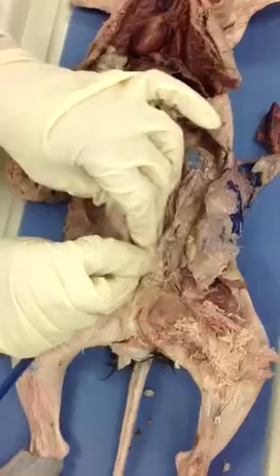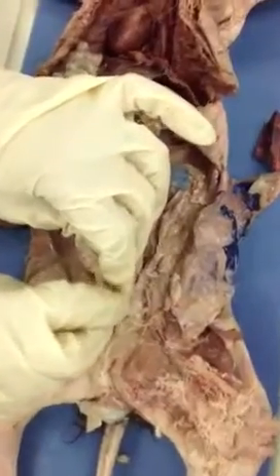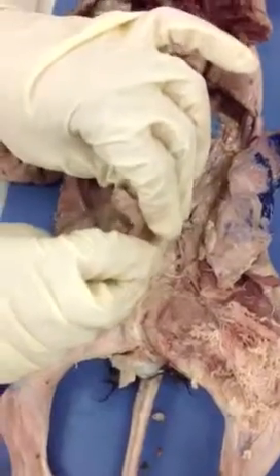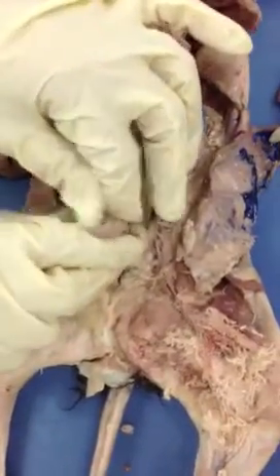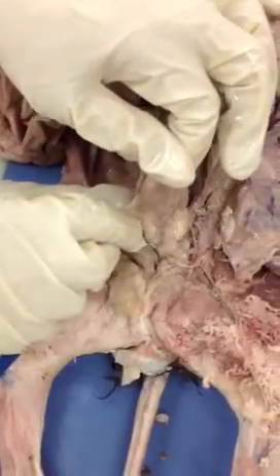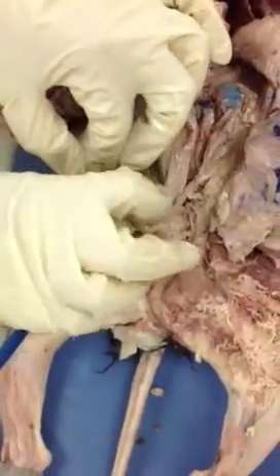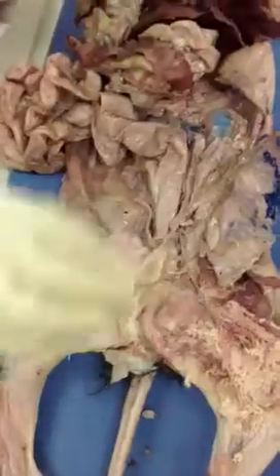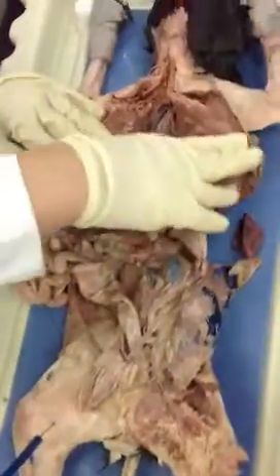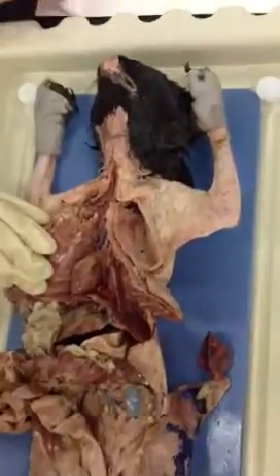In the urinary bladder, I have ligaments as well. What is this one that I'm pulling a little bit here? It's kind of cut off, but medial. Medial what? Suspensory ligament. Very good. Of the bladder. And then this one to the side is the lateral suspensory ligament. Very good. Now, let's continue our journey. What is the name of this organ?